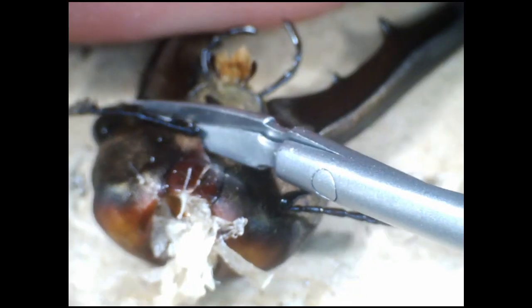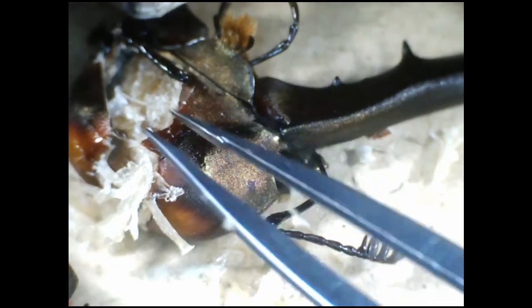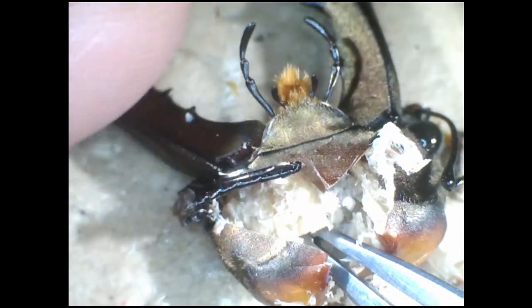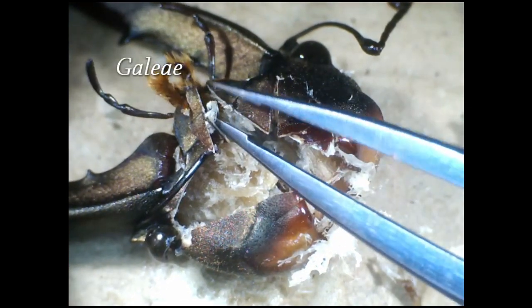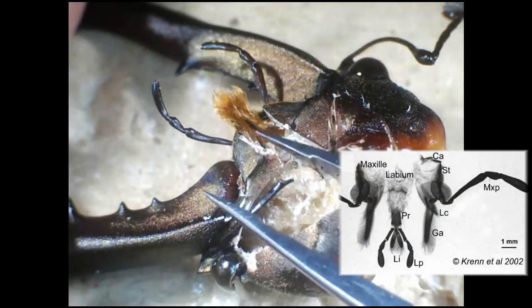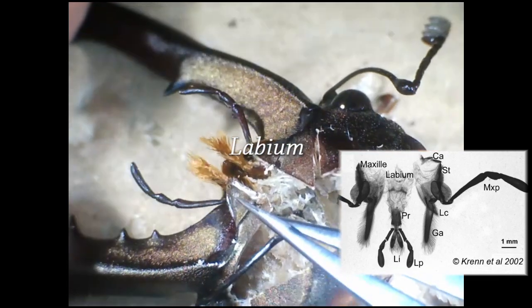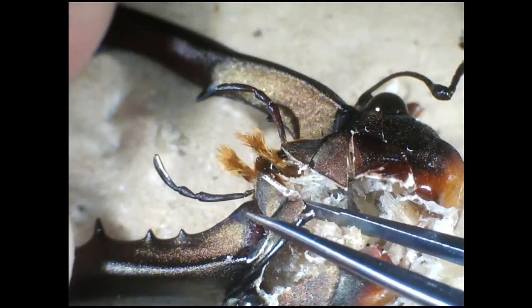Let's open up the head. Here's the main attraction — the muscle that serves the mandible — and this is easy for me to prove. These mandibular muscles are huge and take up most of the head, which is what we expect: wrestling requires a lot of strength. Let's focus on the other mouth parts now. These two feathery yellow bits are called galea, which is Latin for helmets, and they are just protuberances of the maxillae. In this species they are large and feathery because they're adapted to soaking up all of that liquid tree sap the beetle feeds on. The tube in the middle of the galea is the labium — or lips — which are also bristly to lick up the sap. The beetle uses the galea to soak up the sap, then moves them in and out of its mouth to feed, as though licking a lollipop.